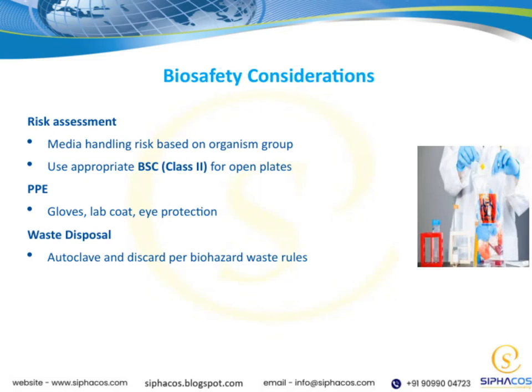Now, let's talk about biosafety considerations, which are crucial when working with biological materials. First, we need to conduct a thorough risk assessment to understand the potential hazards involved. This involves evaluating the type of organism we're handling and the associated risks. Based on that assessment, we should handle the media carefully, especially when working with different organism groups, to minimize any potential exposure or contamination. When working with open plates, it's best practice to use an appropriate biosafety cabinet, specifically a Class II BSC, to provide a safe environment for both the researcher and the sample.